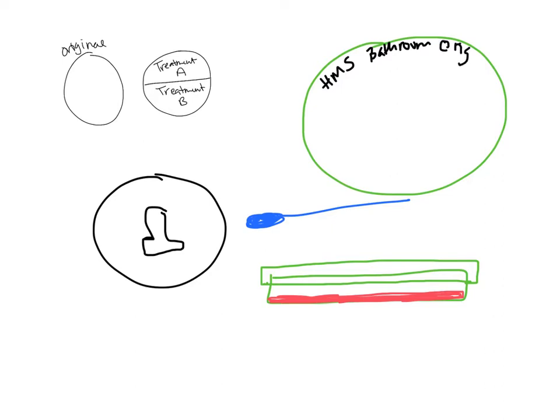So this is the original bathroom handle. You'll know what it is, but you want to make sure you know which treatment it is or whether it's the original. And then we should put the date. You notice how I'm labeling all around the edge there.